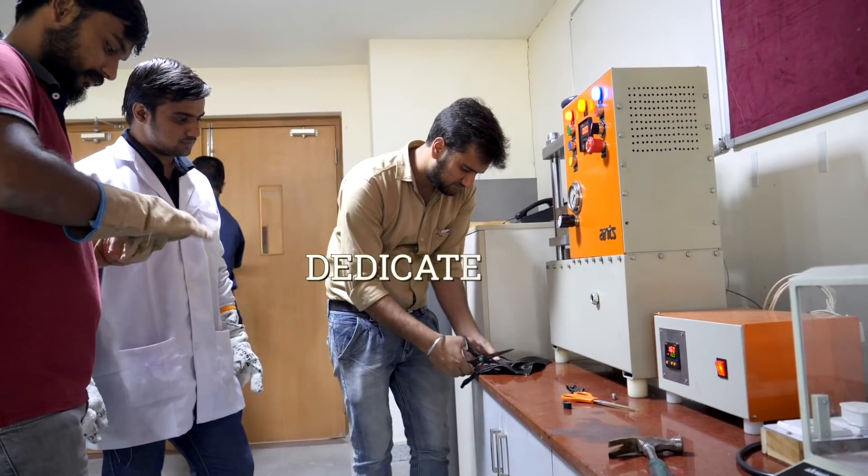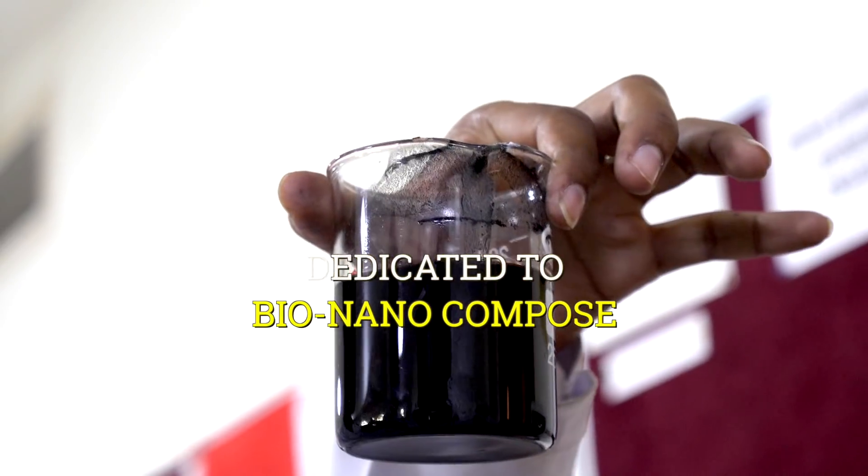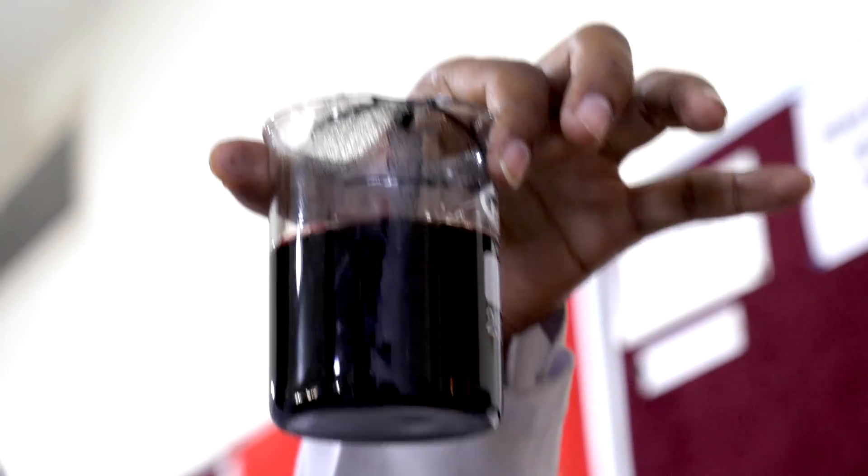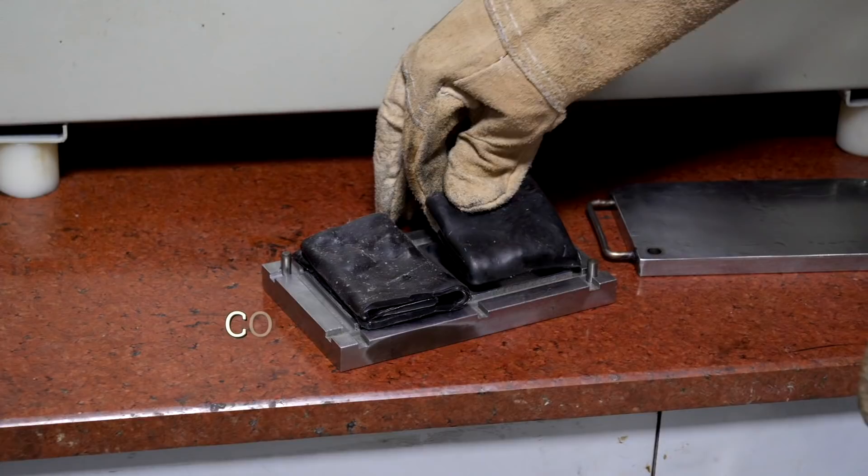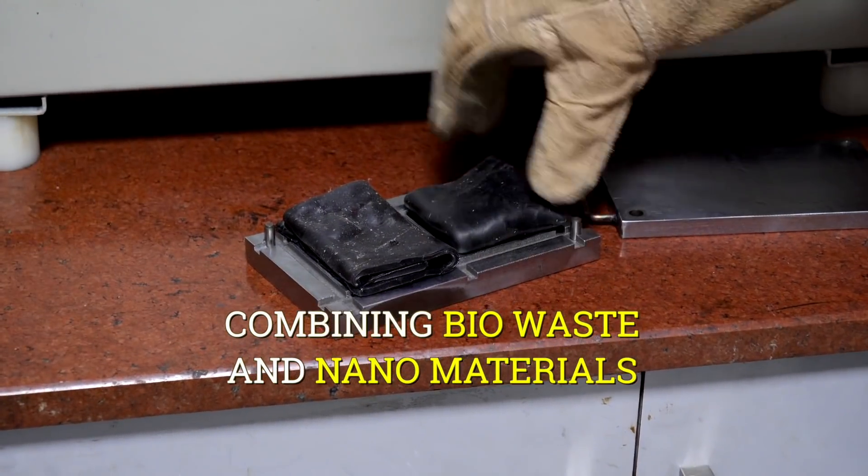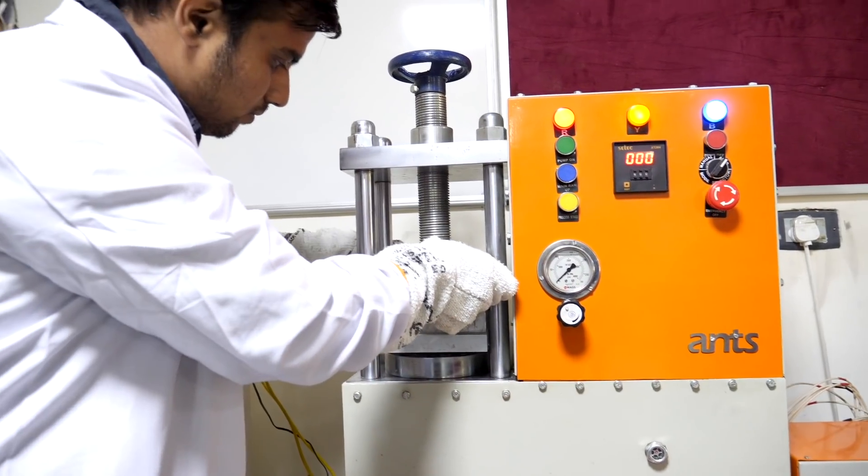This lab is dedicated to bio-nano composites. The name of this lab is Bionac. Here we work with bio-based materials like natural materials and nanomaterials. It's a combination of bio-based materials and nanomaterials, and then you develop a composite which is known as bio-nano composites.